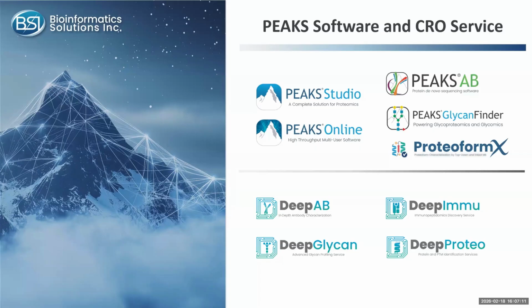So to start off, for those of you who may not be fully familiar with BSI products, we do offer a whole software suite for proteomic solutions, as well as antibody sequencing and glycoproteomics. We also just recently released Proteoform X, which is our solution for proteoform characterization.